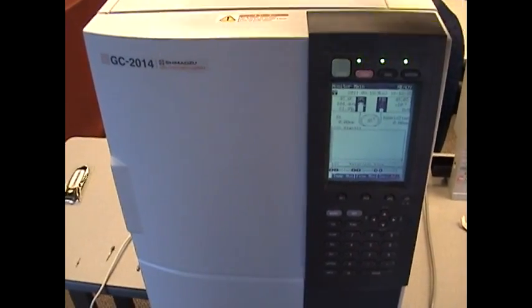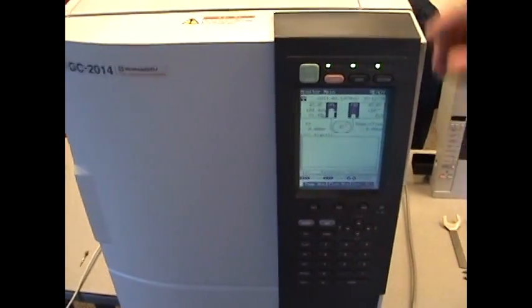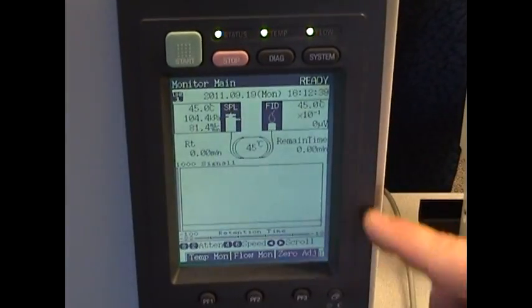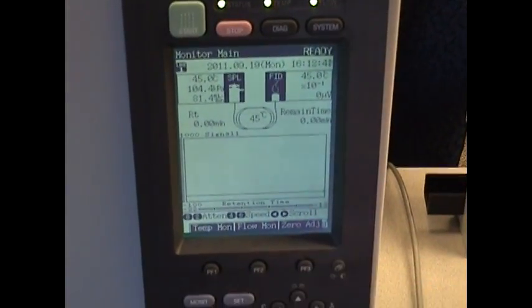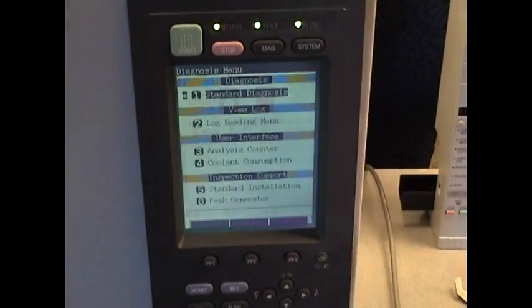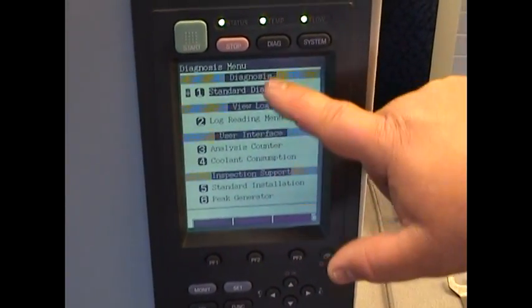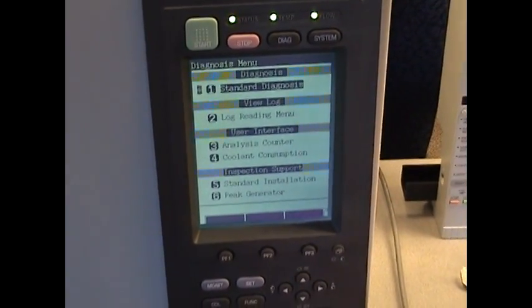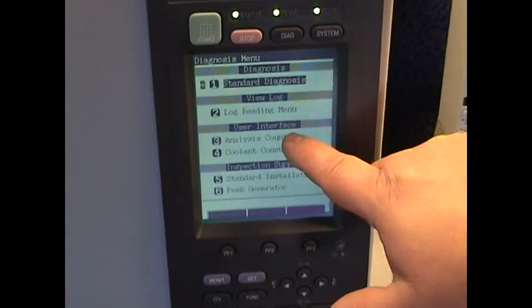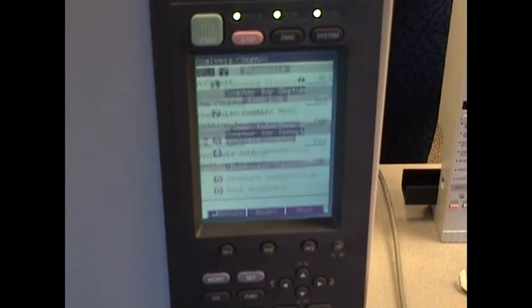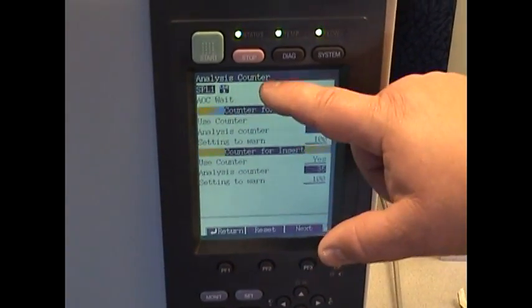Once you go ahead and replace a septa or an injection liner, you go on and reset the instrument on the counter because it has a counter inside. So you get to your main screen, push monitor, push the diag button. That brings you to this screen. Okay, it's diagnosis menu. You can just simply want to go to analysis counter, push three and enter. And that brings you to analysis counter here. Don't worry about the AOC weight.